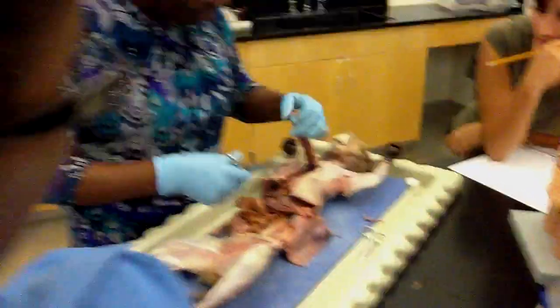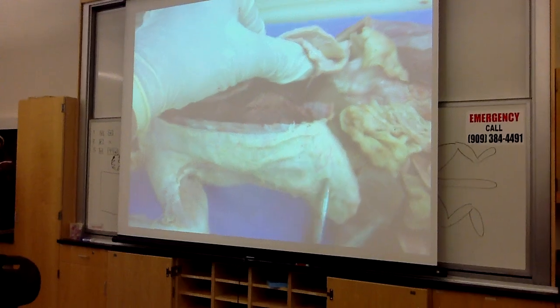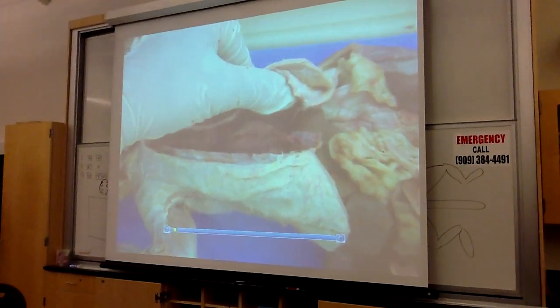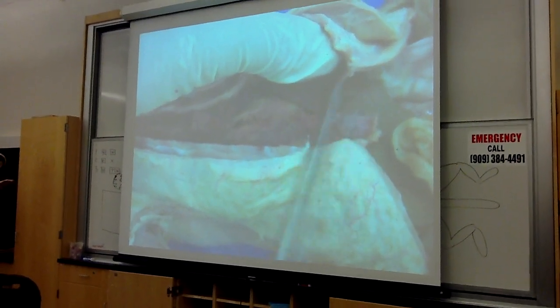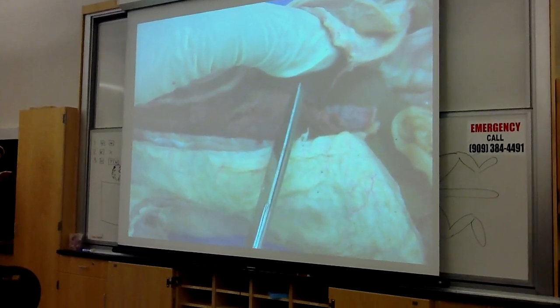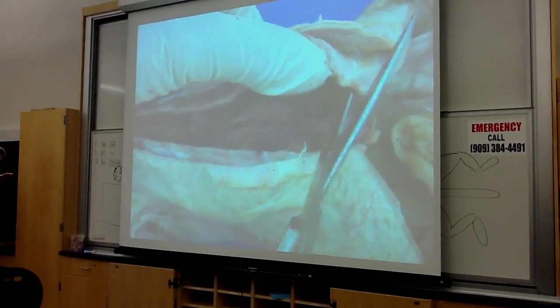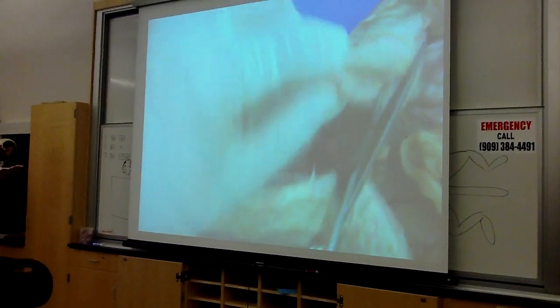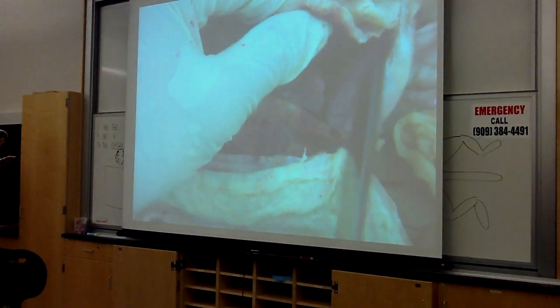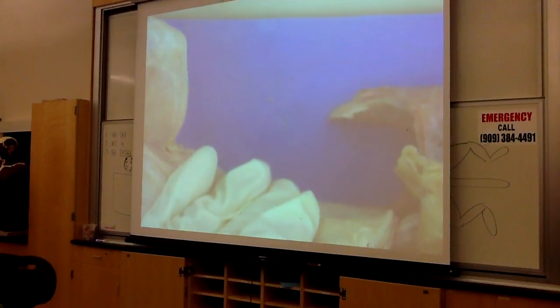Okay? Now, here's my last 2 cuts. I'm going to get my thumb inside the thoracic cavity here. And what I can see is a muscle called the diaphragm right here. It's a breathing muscle. It separates the abdominal cavity from the thoracic cavity. I'm going to lay my scissor blade alongside that and cut again into the body wall. Don't cut down here. Don't cut the diaphragm. Cut the body wall, but cut it right alongside the diaphragm like this. One blade in, go like this, okay?